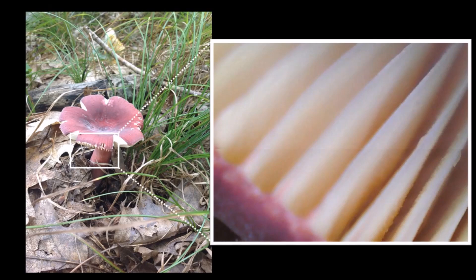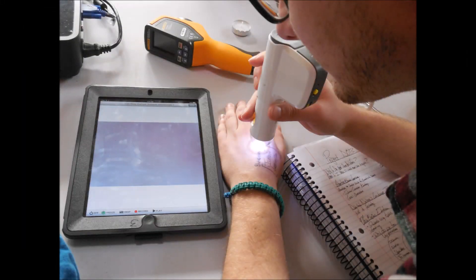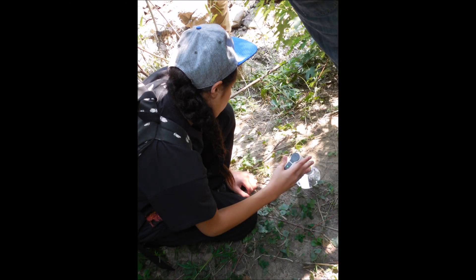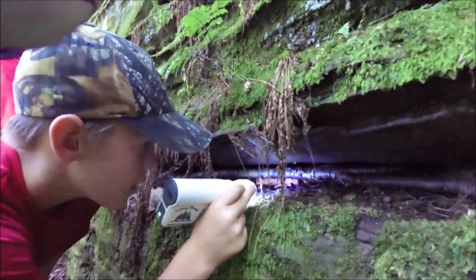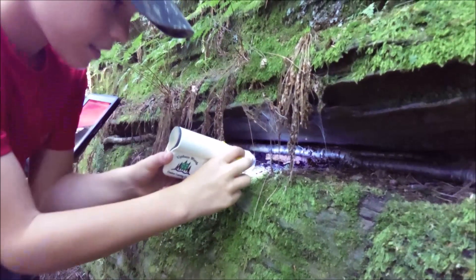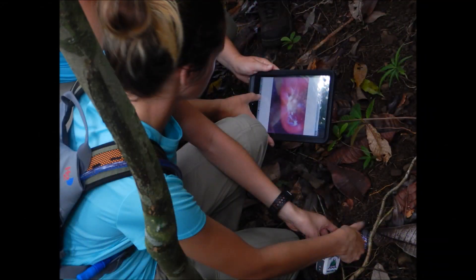The digital microscope is used in conjunction with the iPad and the WiViewer application for optimized viewing in groups. You may notice that there is no cord — the digital microscope has its own Wi-Fi source, which is easily connected to the iPad. This allows us the mobility to take DOTS learners straight to the samples instead of collecting in the field and then compromising samples brought back to a lab.